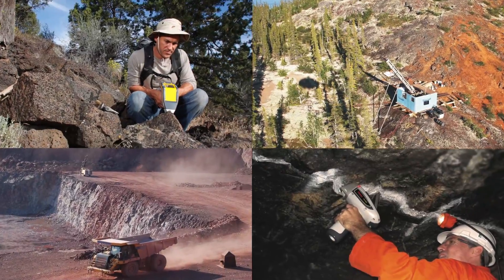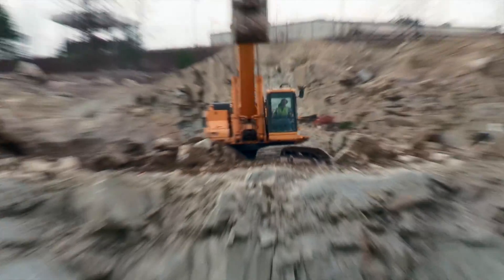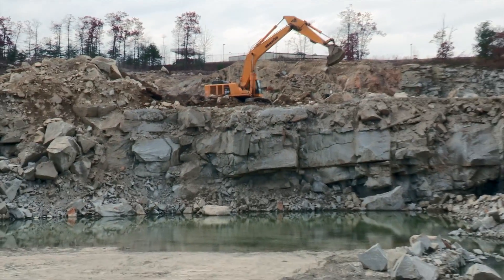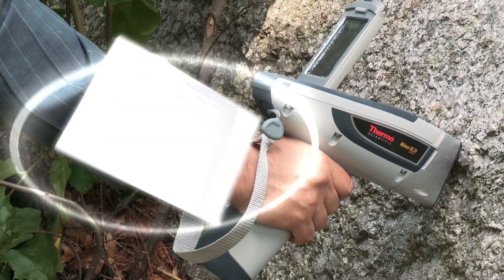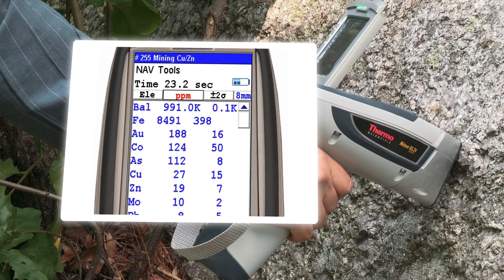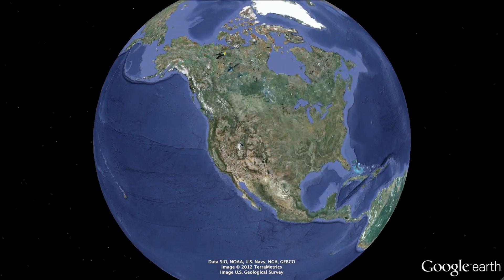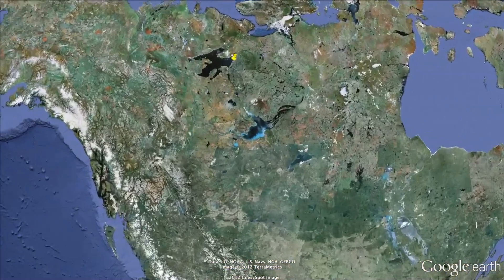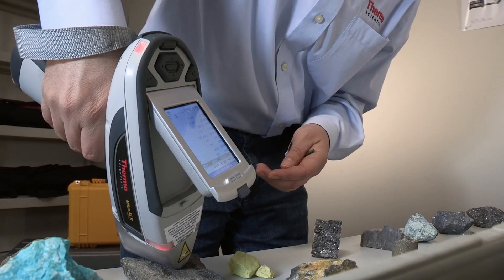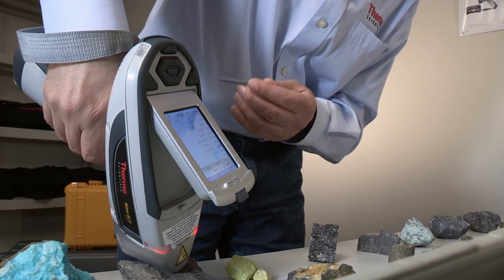Whether you're conducting a grassroots exploration or looking to continually improve your ore processes in an operating mine, the need for more information with greater accuracy, precision, and speed has driven the need for new tools and new solutions. With over 2,500 Thermo Scientific portable XRF analyzers deployed in the global mining markets, we are helping to fulfill those needs. Companies use our analyzers every day to help them make informed decisions.